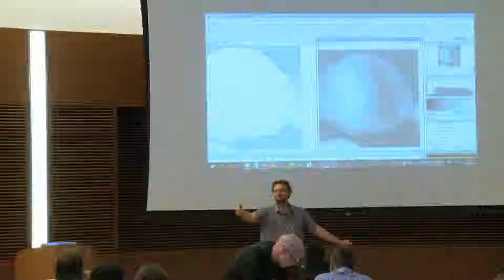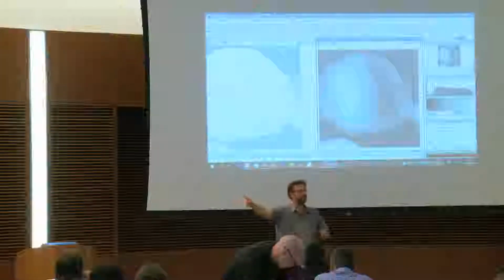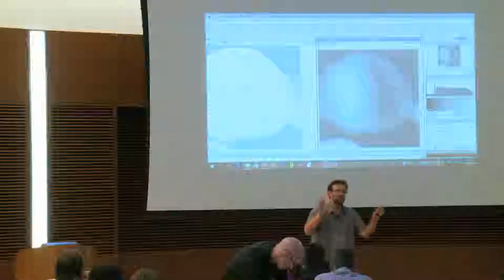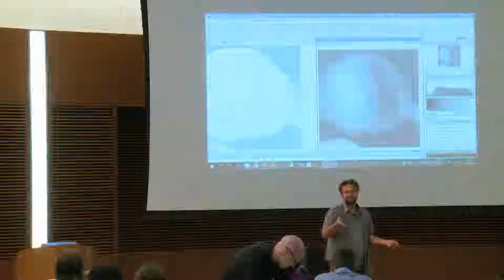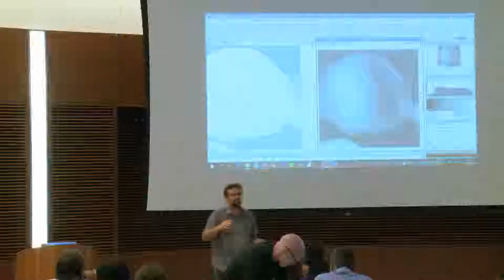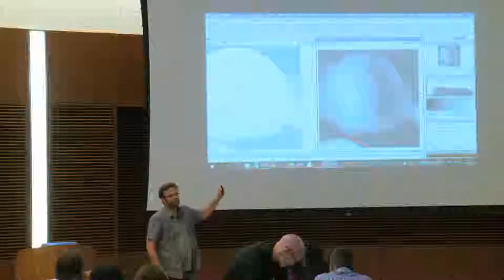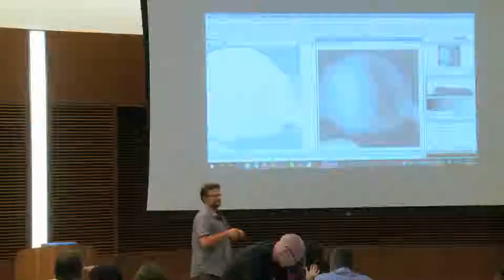One direction? Okay, so for the one who says one direction, which direction would you say? So from here to here, so from your left to your right, or from right to left? Or you can also say, I can't say. Okay, do you believe we can say it further on? Do you believe that afterwards we will be able to answer this question just by this image? I think I don't really understand how the technique works, so I don't.